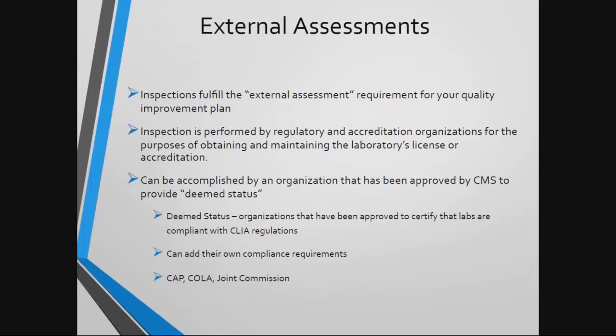Deemed status means that the organization has a CMS-approved plan to evaluate a facility's CLIA compliance. These organizations must evaluate a lab based on CLIA regulations at a minimum, with additional standards often being added by the regulatory agency. Examples of such organizations are CAP, COLA, and Joint Commission, of which most of you are very familiar. Today we are going to talk about CAP inspections specifically. However, much of what I will discuss can certainly be applied to other regulatory bodies.